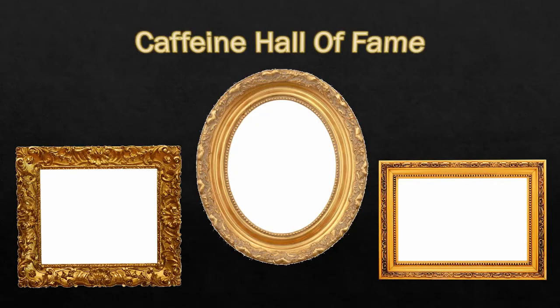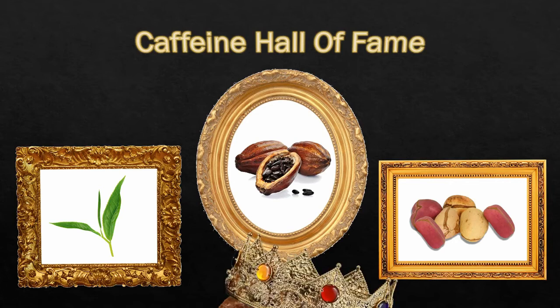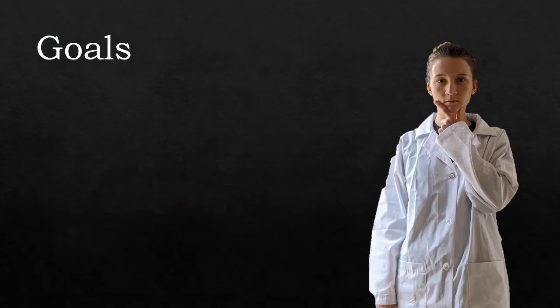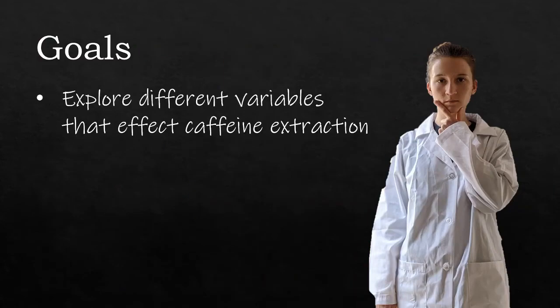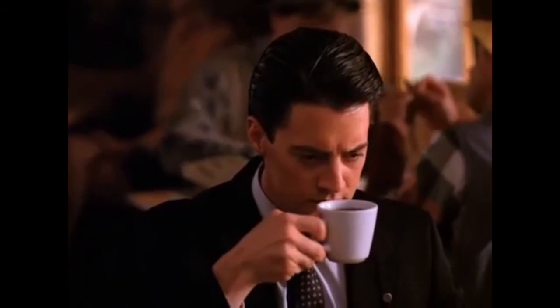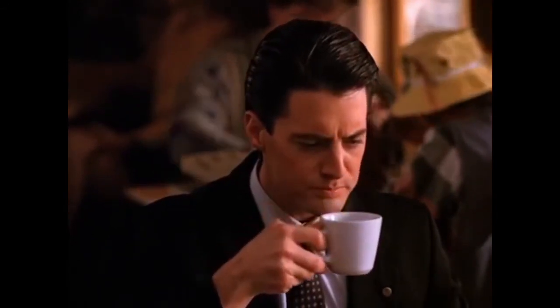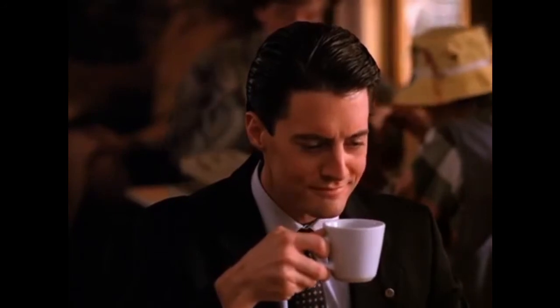It occurs naturally in tea leaves, cocoa pods, kola nuts, and coffee beans. The goal of this experiment is to explore different variables that affect caffeine extraction and determine which has the greatest impact. We'll be able to see how to better extract caffeine from coffee beans when we brew coffee so society can extract as much of that precious caffeine as possible.